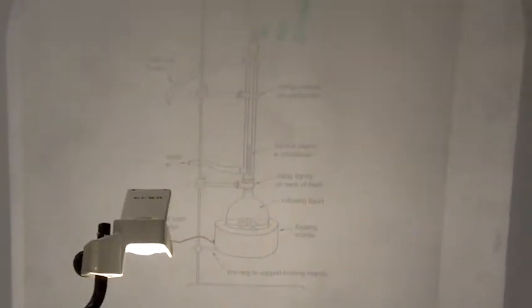Now, the key new equipment piece to this whole thing is the reflux apparatus. Okay, so when you're doing the hydrolysis reaction, we're doing this at what is called reflux. Okay, and this is the apparatus that we're going to use.